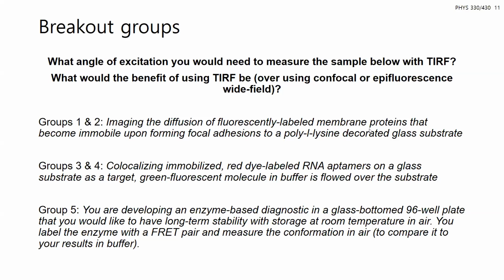Yeah. And I would say if you're doing confocal, let's say you're trying to look at the target come into the aptamer, you're sitting on that aptamer and waiting. With confocal, you can just look at one at a time. Since you're just sitting there, you might sit there long enough that the aptamer might bleach and you won't see something come in and bind within that time. So again, looking at a wide field, you can get a lot of statistics there quickly. And then finally, let's move on to group 5.